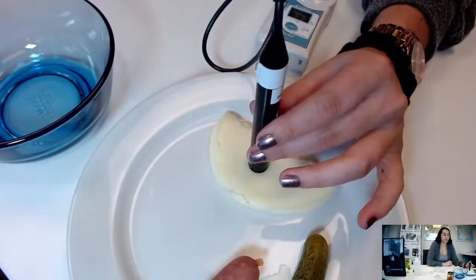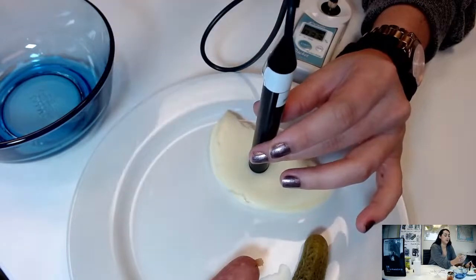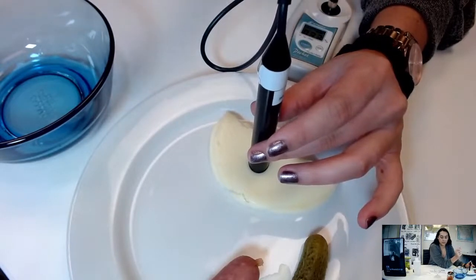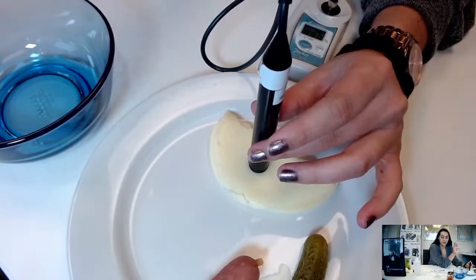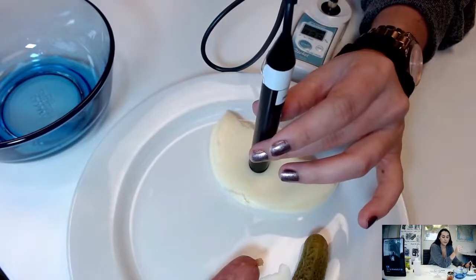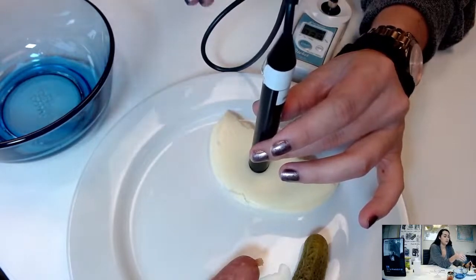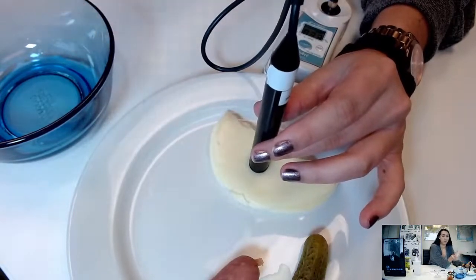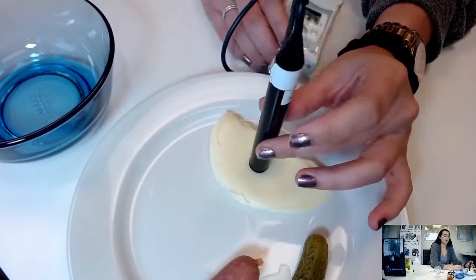Now that we've gotten those, I just want to mention some factors that could affect measurement results. Like I mentioned, you want to make sure that if you have a thin sample that you are layering and making sure that all the probes are being covered by the sample to get the most accurate measurement. Also, the detection method of this salt meter is the conductivity method, like I mentioned in the beginning of this meetup, and the displayed value corresponds to the salt concentration indicated in percentage. So it is grams divided by 100 grams. The measurement range is between 0.00% and 7% of concentration. So if your sample is outside of that range, if it is over 7%, you could get some issues. Pickles, brine solutions, sausage are typically very salty, and as you can see here, they are well within that range, so there are no issues there.